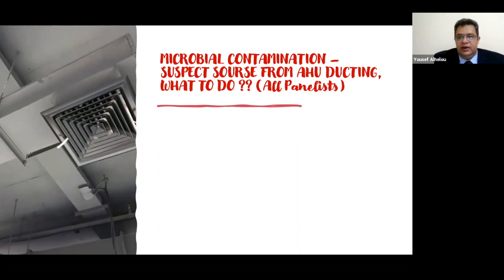Usually, we equip the air handling unit with pre-filters and then a HEPA filter in the unit. After the HEPA filter, we have UV light that kills the microbes and a VOC filter, and finally a terminal HEPA filter inside the lab. We need to check the performance of the terminal HEPA filters and change them every 6 months.